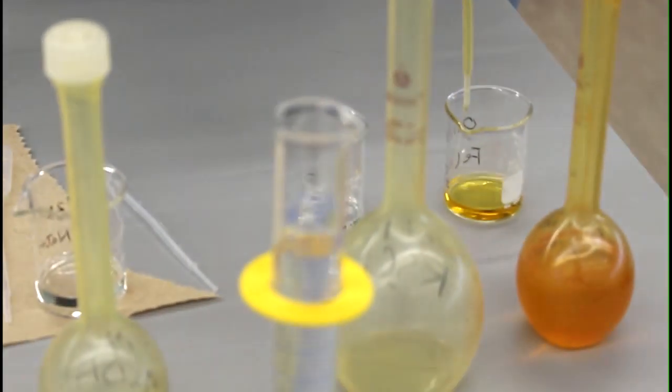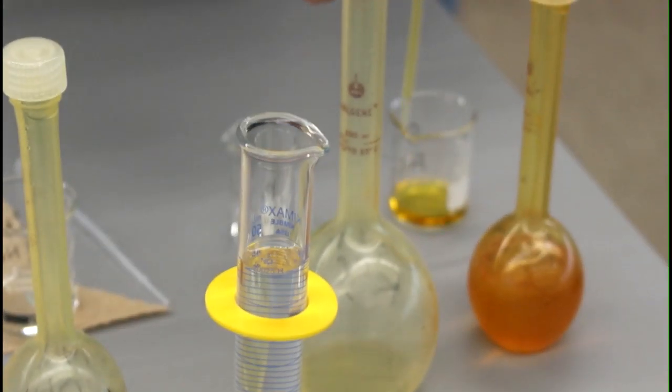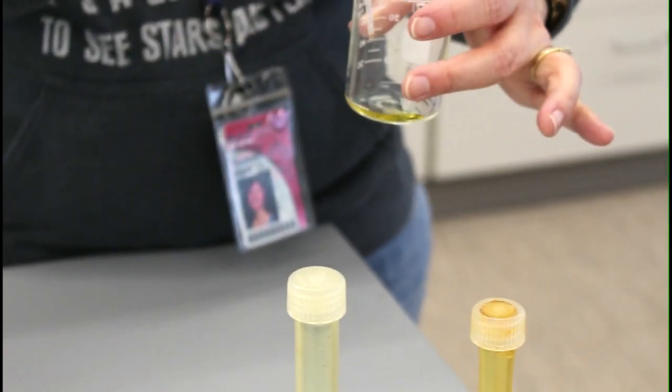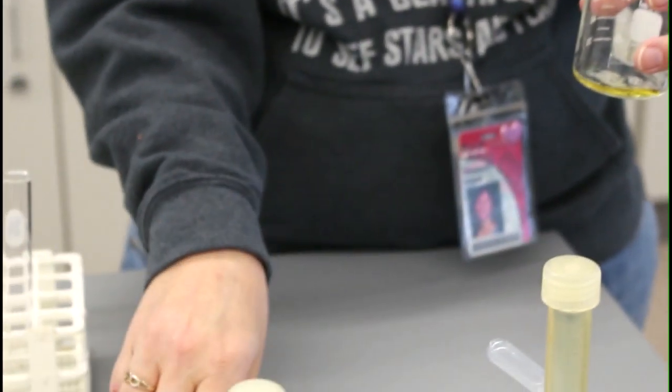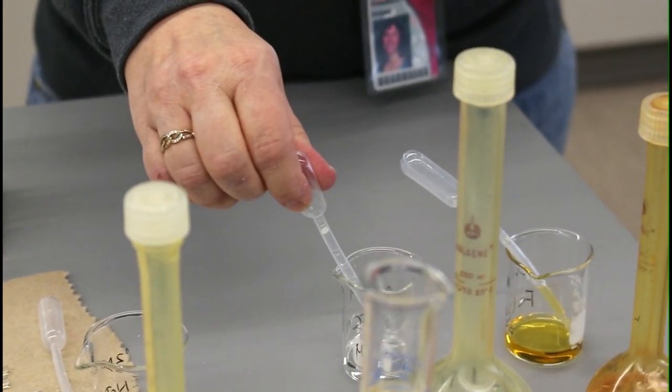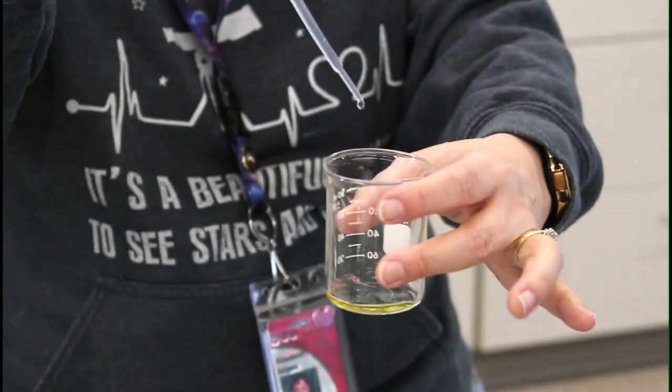We only have 2 reactants, so your instructions are to go ahead and take 1 ml of your iron 3 nitrate, and the nitrate is a spectator ion. We want to make sure it's just 1 ml instead of the whole thing. All right, there's 1 ml. Then the other reactant is the thiocyanate. We're going to use potassium thiocyanate, and here we go.